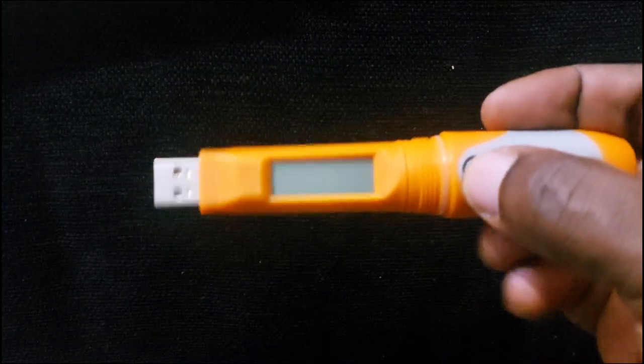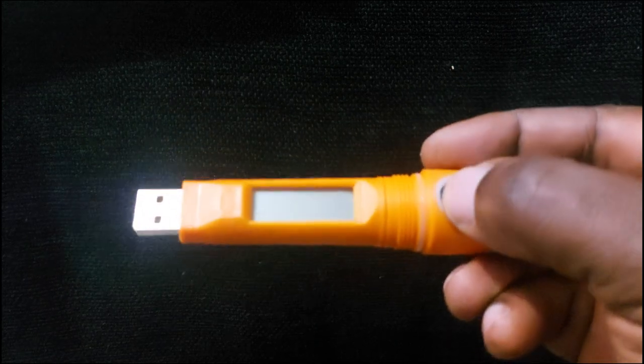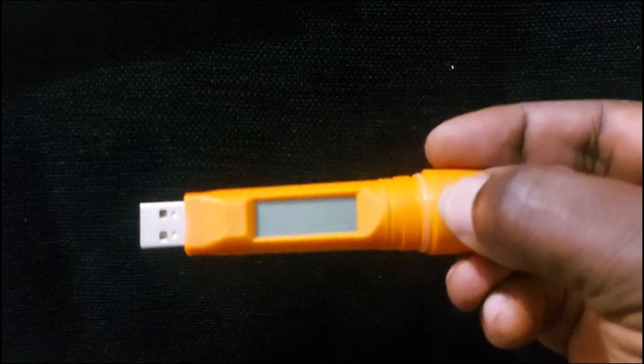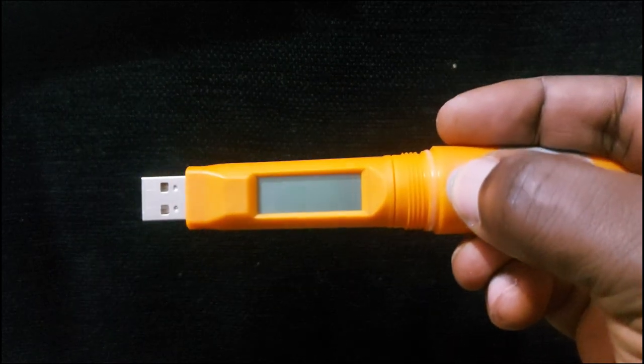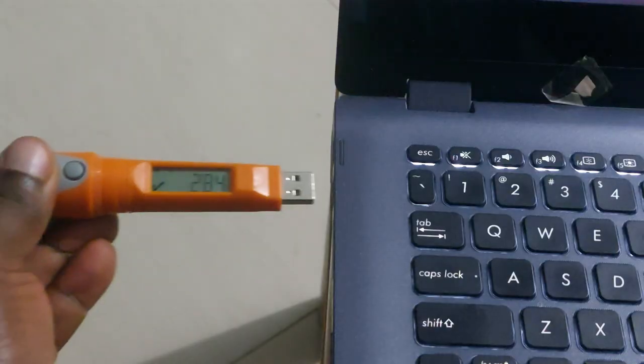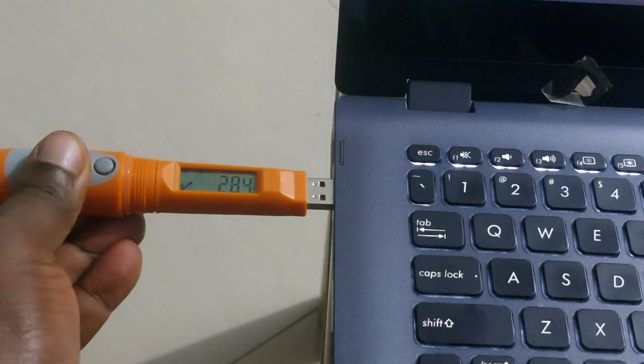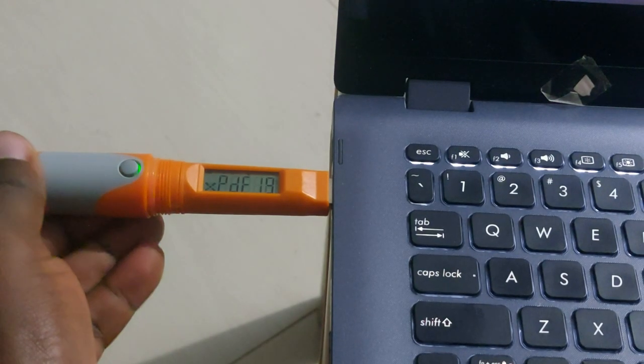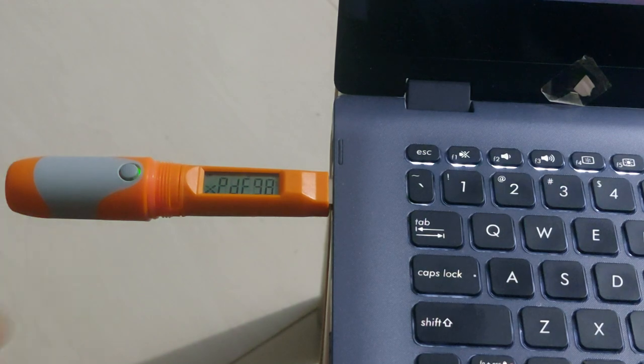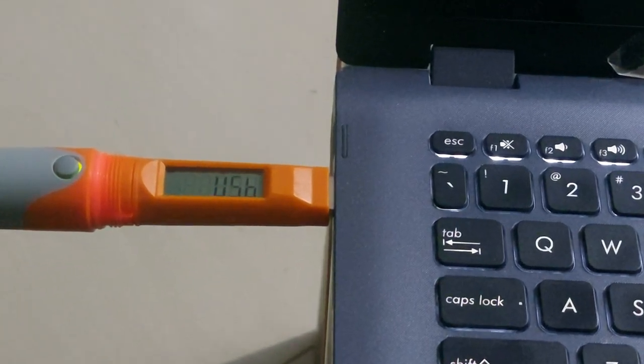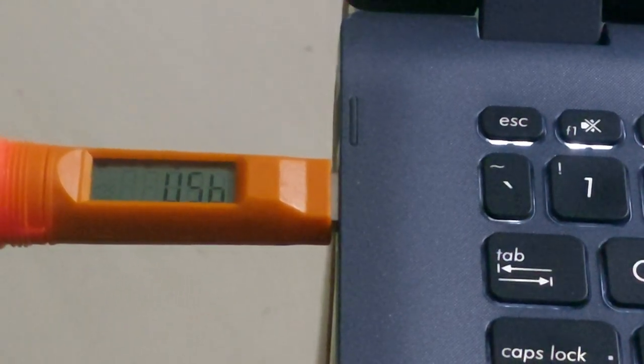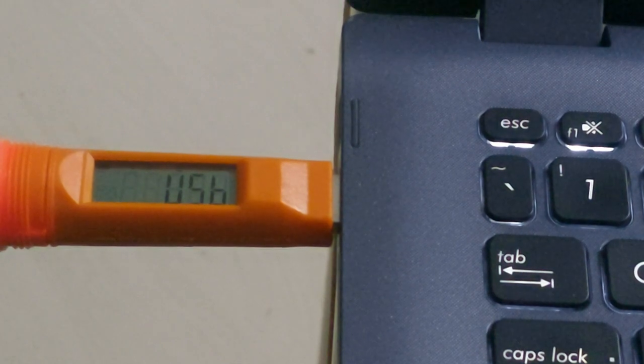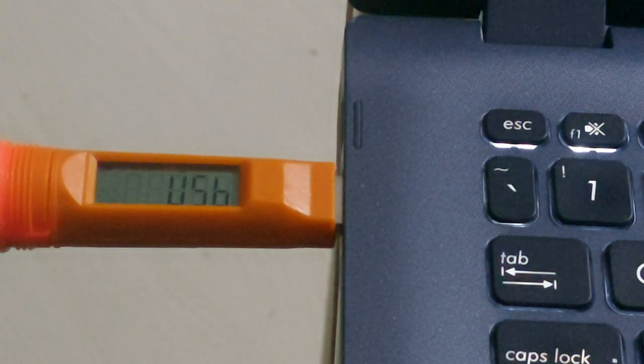Press the button on the side of the device until the display turns on. Set the logger into a USB port of your computer. Observe for the text USB to be displayed on the readout of the logger.